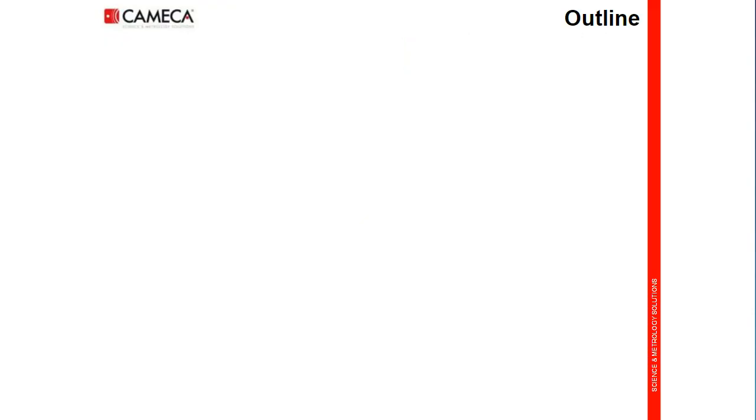I will show now the outline of this talk. I will start with a brief introduction to the dynamic SIMS technique, magnetic sector SIMS instrumentation, and typical outputs.